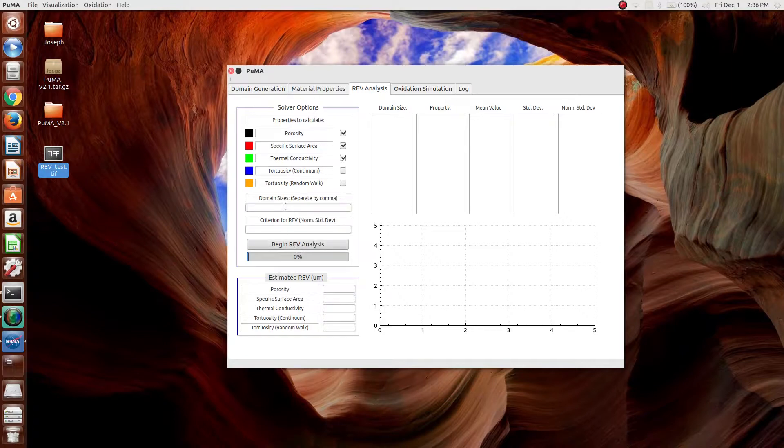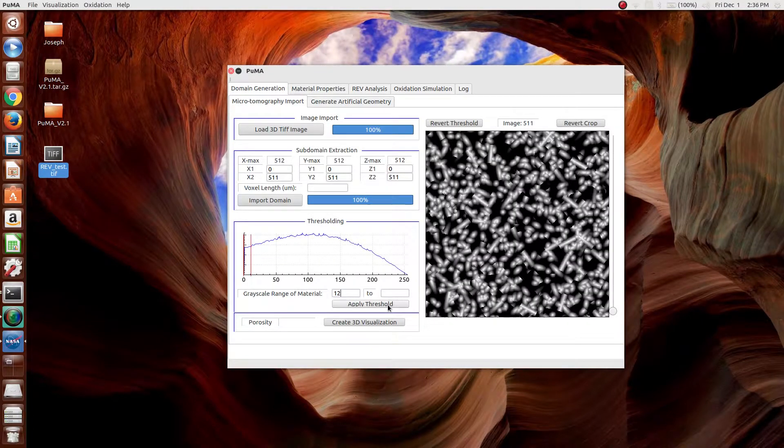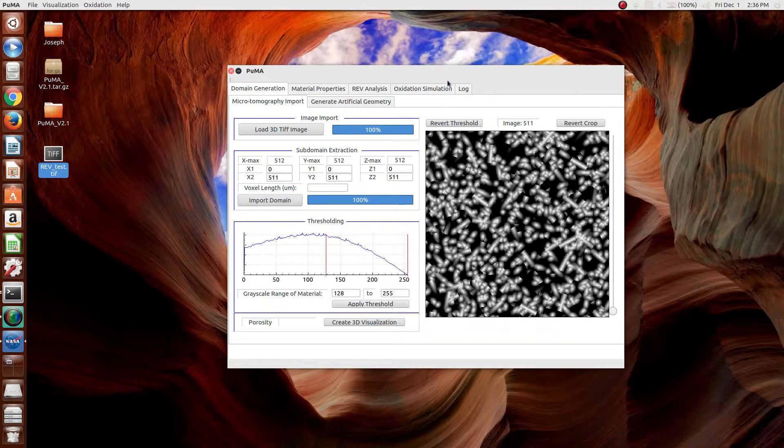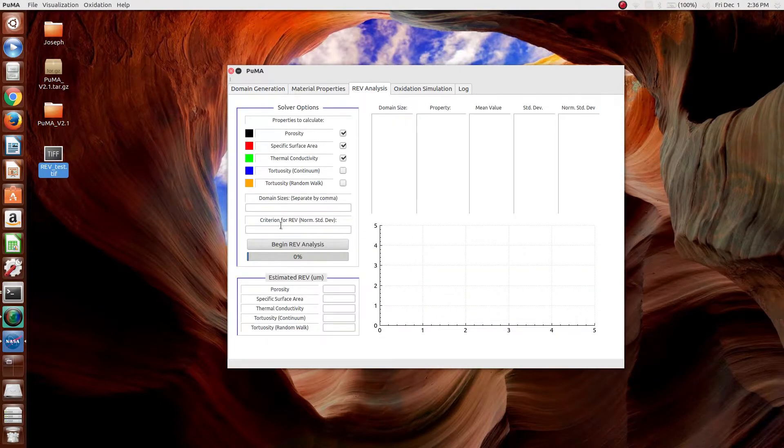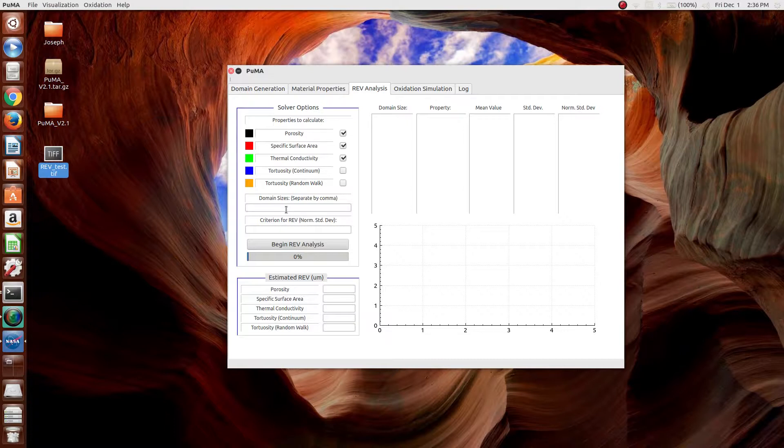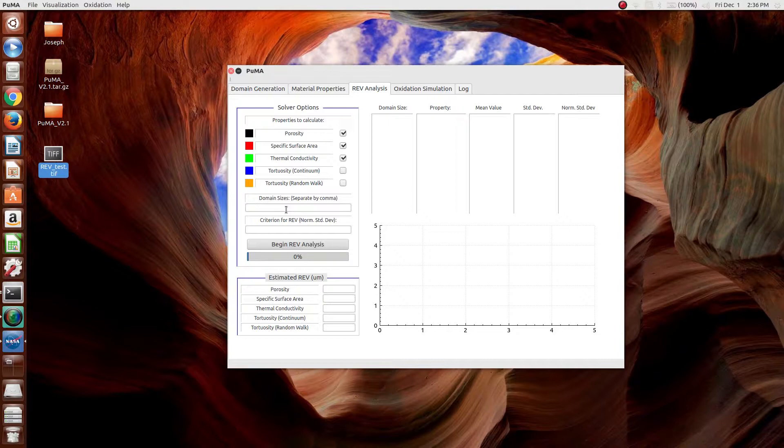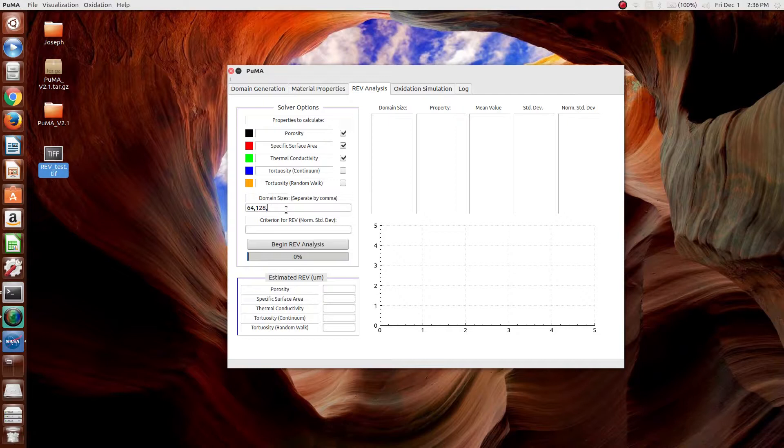Next is to choose the domain sizes. Since this is a 512 cubed sample, the domain sizes have to be smaller than that, and the largest domain size has to be half or less of the 512 cubed. So, in this case, we can go 64, 128, and 256.